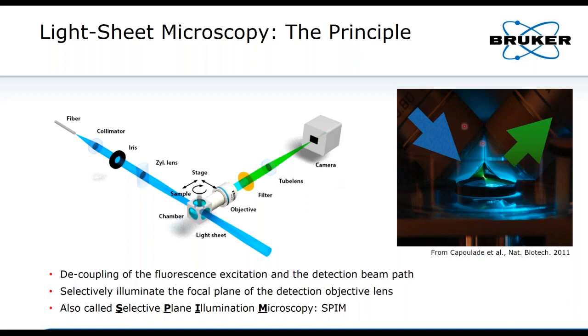On the right side, you can see a photograph of a light sheet microscope that we built at some point in our lab at EMBL in Heidelberg, where it basically illuminates your sample with one objective lens to form a very thin light sheet here, which is then the focal plane of an identical objective lens here to the right that images the fluorescence excited in this focal plane, in this case, the fluorescence solution, to highlight the concept on an EMCCD camera.